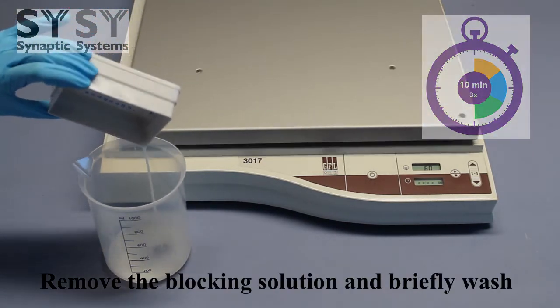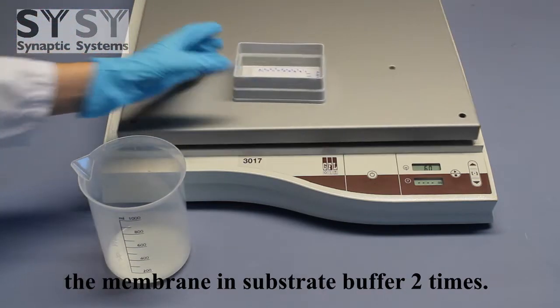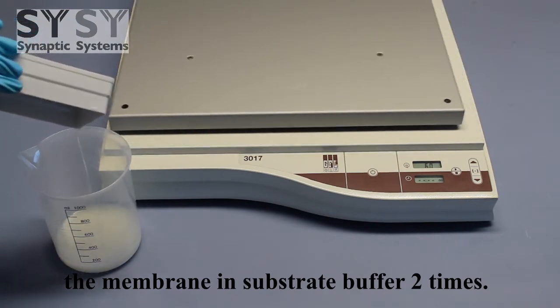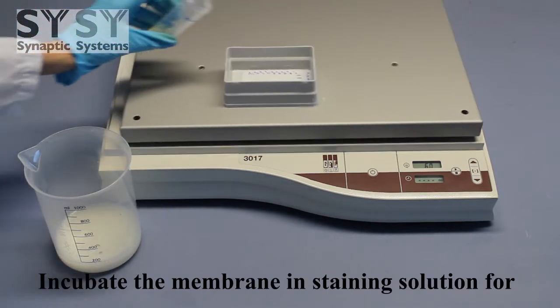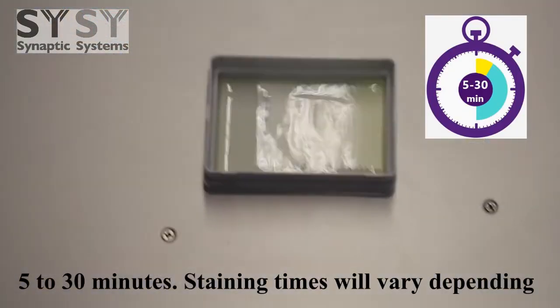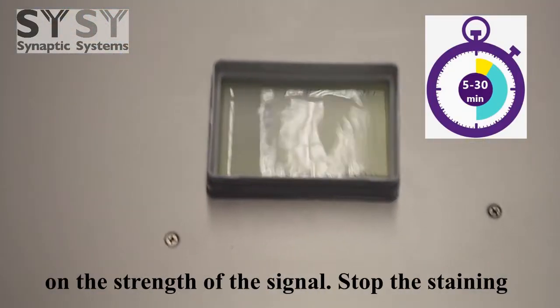Remove the blocking solution and briefly wash the membrane in substrate buffer 2 times. Incubate the membrane in staining solution for 5 to 30 minutes. Staining times will vary depending on the strength of the signal.